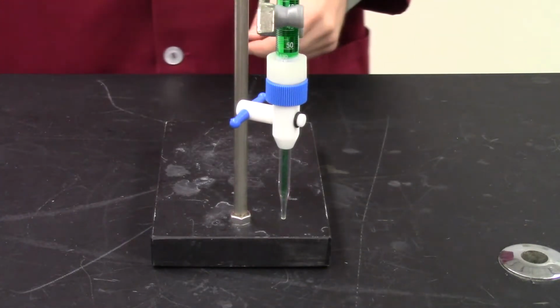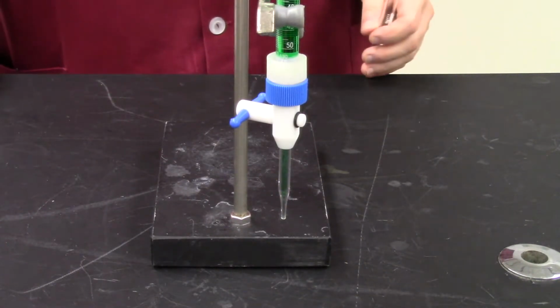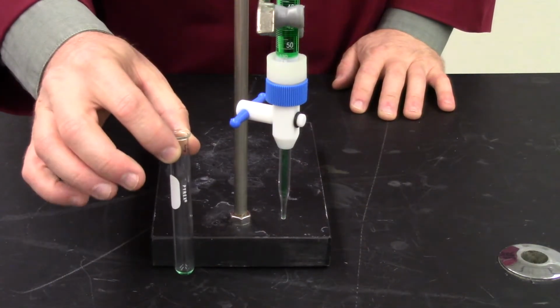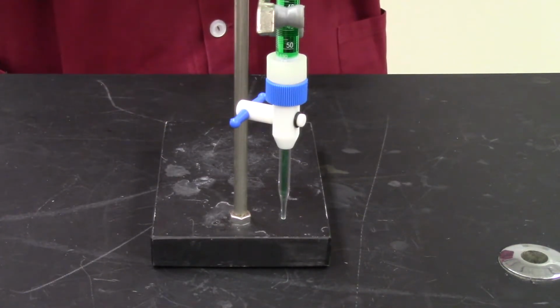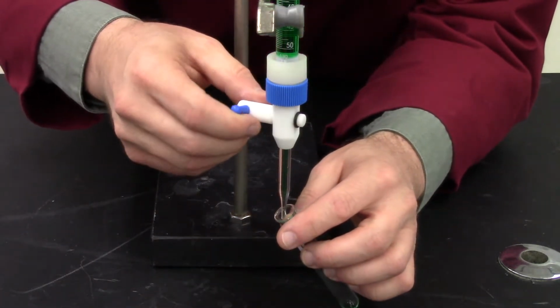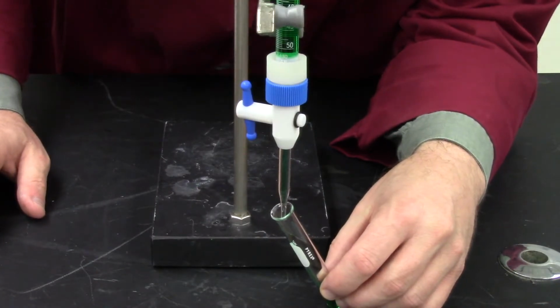Now the book tells us we should do the burette readings again so we can have a more accurate reading for the next step. What we're going to do is fill the same test tube with water again from the burette. I filled it back up to 0. You saw the meniscus there. And now I'm going to fill this test tube up with water, the same way we did before using the burette.